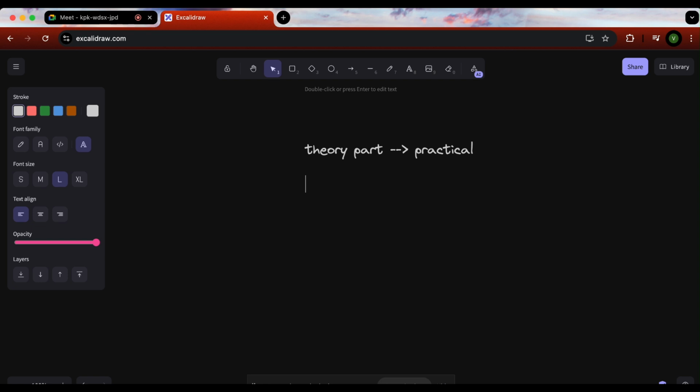Now when it comes to the practical part, we need to do certain analysis. So we are here for the analysis, and the data which we are interested in is RNA Seq data, and we are basically talking about mRNA. Why? Because these are the ones responsible for the functionality.